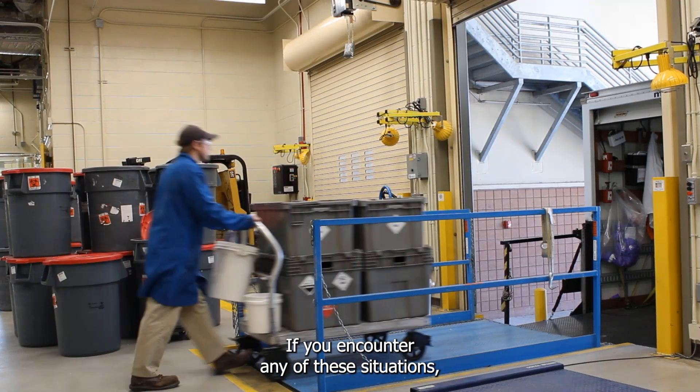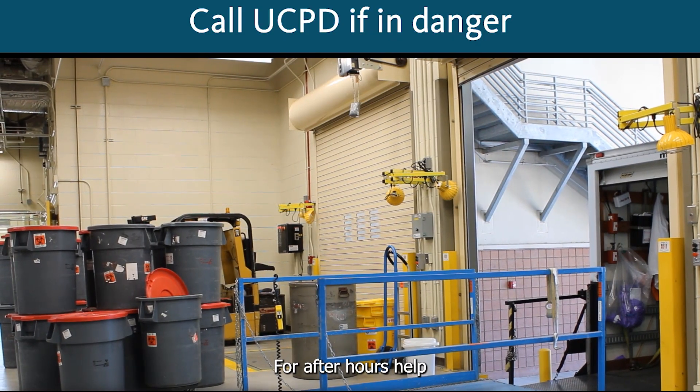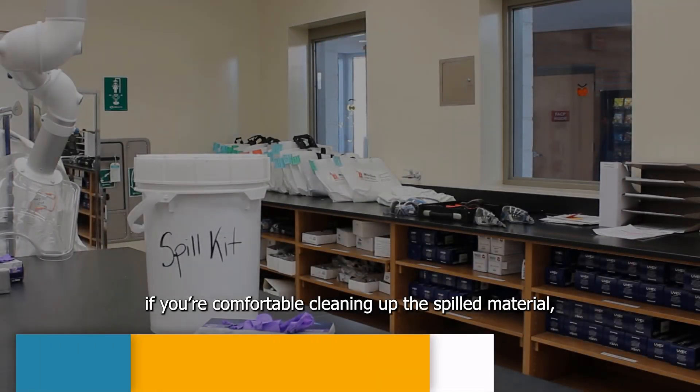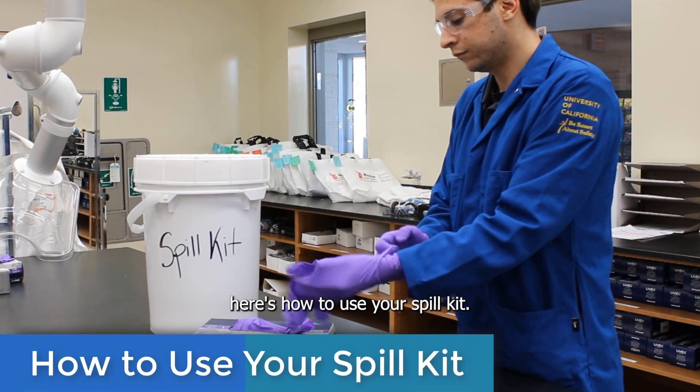If you encounter any of these situations, call EH&S for assistance. For after-hours help or if you believe to be in imminent danger, call UCPD. If you're comfortable cleaning up the spilled material, here's how to use your spill kit.